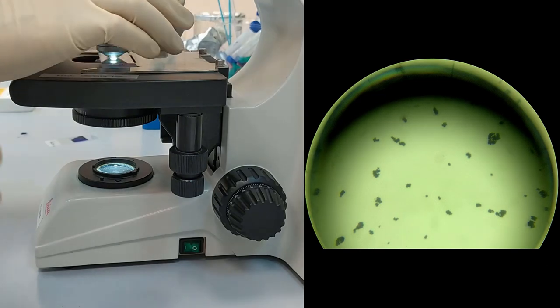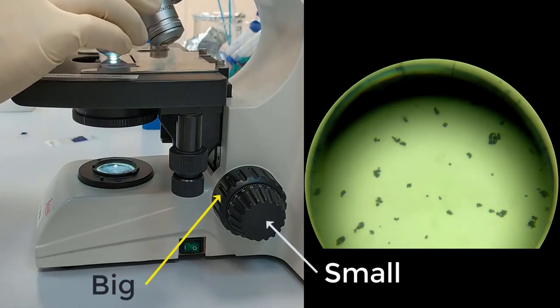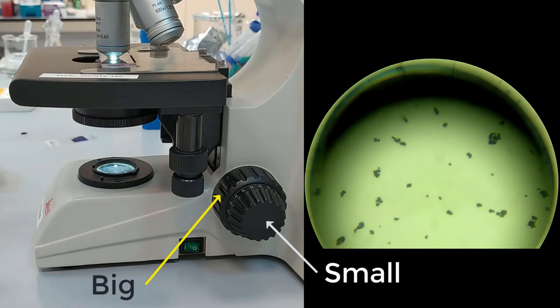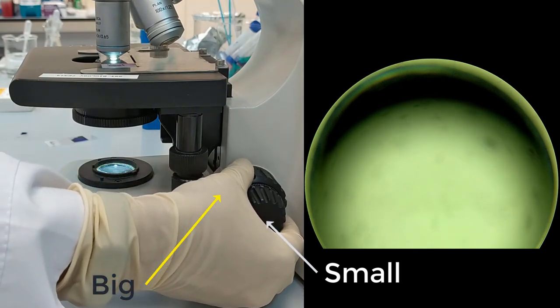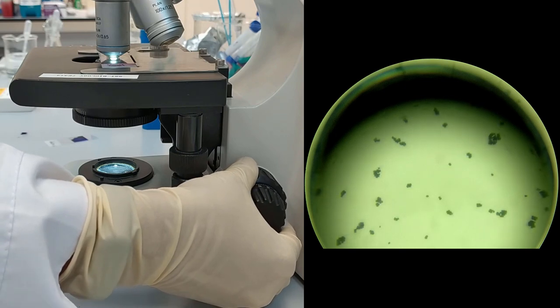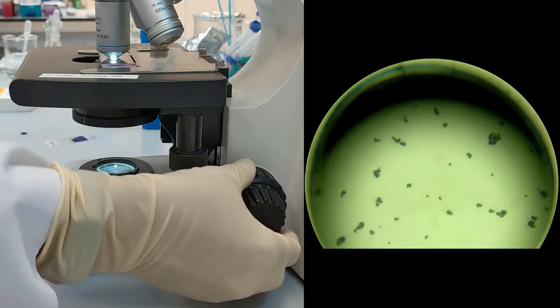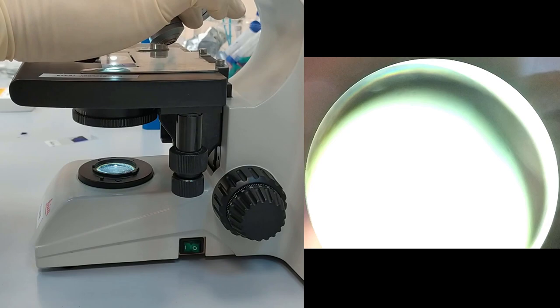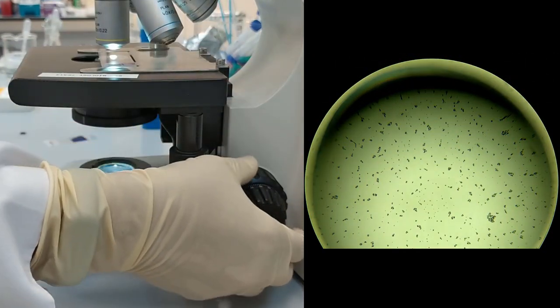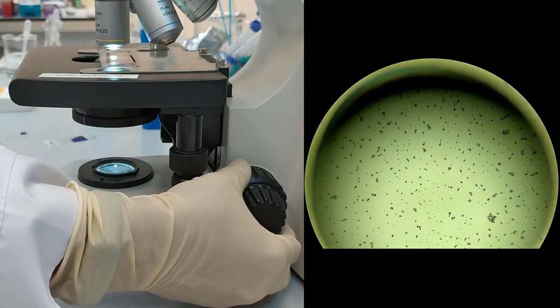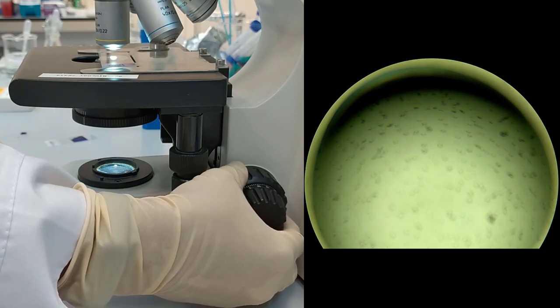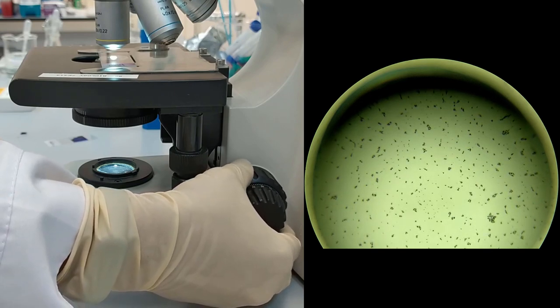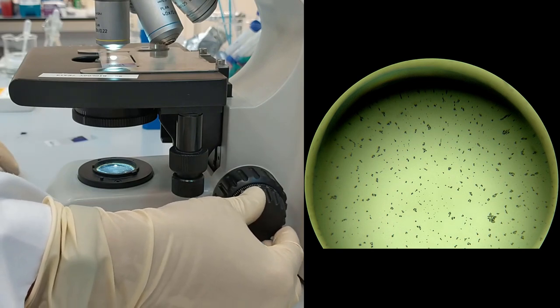On the microscope controls, you can see the big knob and small knobs. On the big knob, we can adjust the focus roughly and using the small knob we can finely tune it.